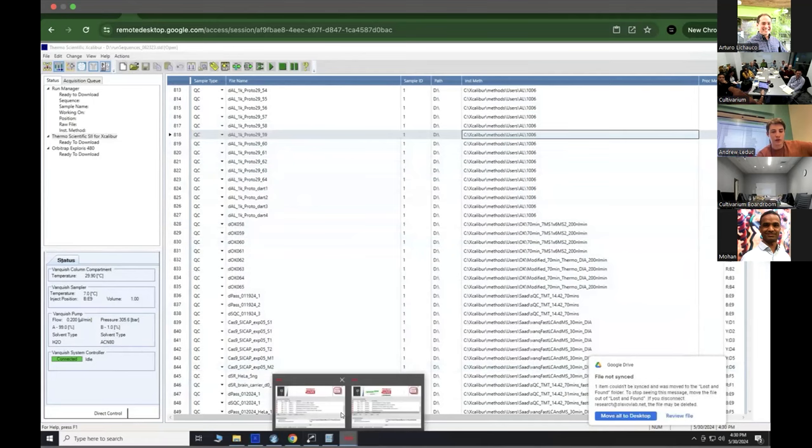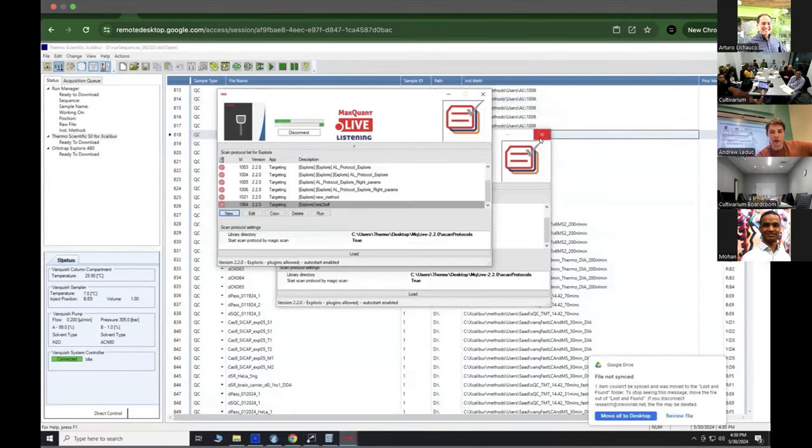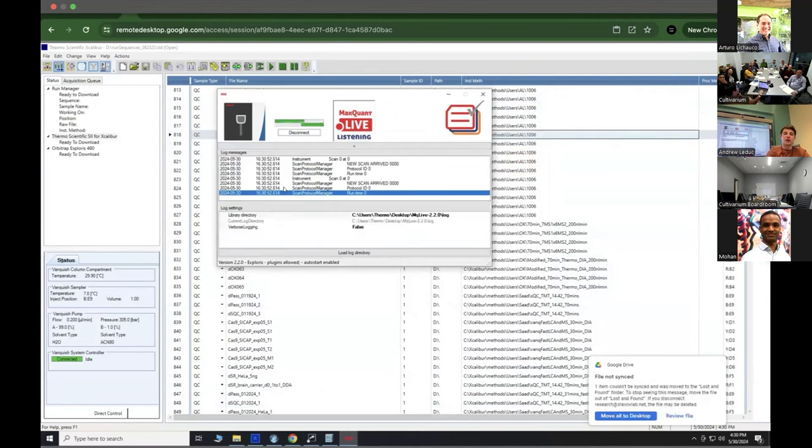And as long as you've connected the instrument and MaxQuantLive, okay, as long as it's connected, you'll see these green things flashing. It's listening. And you can also tell because the scans are coming in. And then as long as you run this method, you're good to go. It'll pick up and it'll do the search. So that's kind of a brief tutorial.